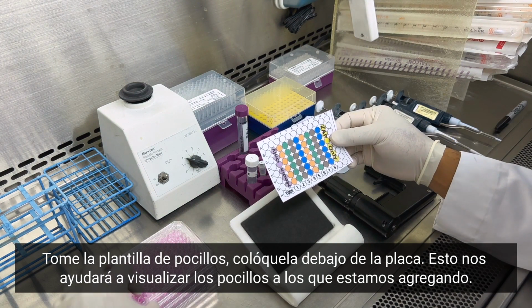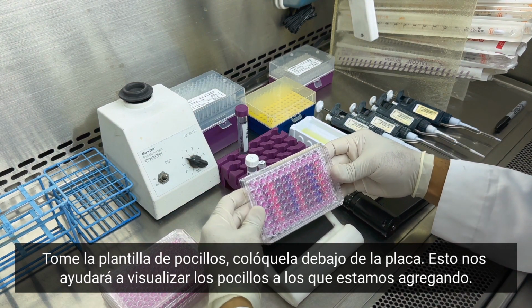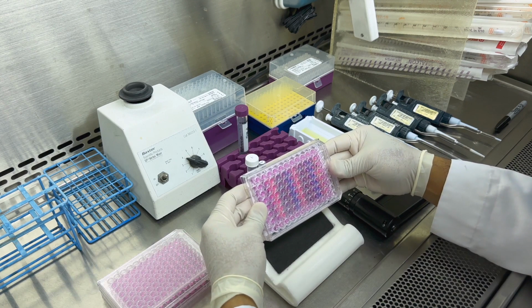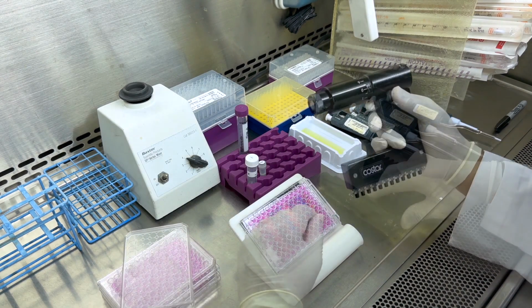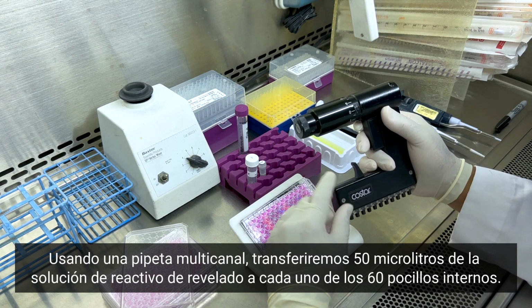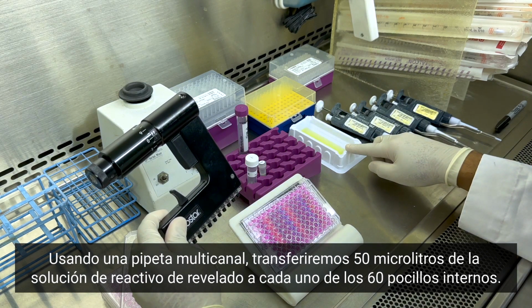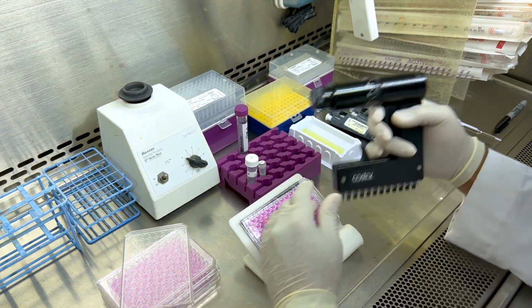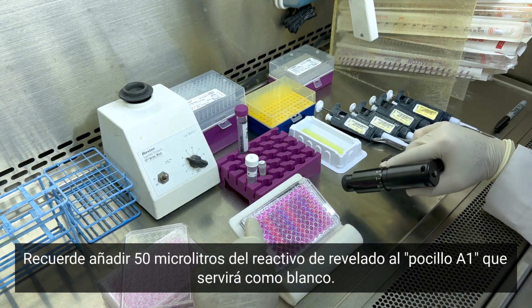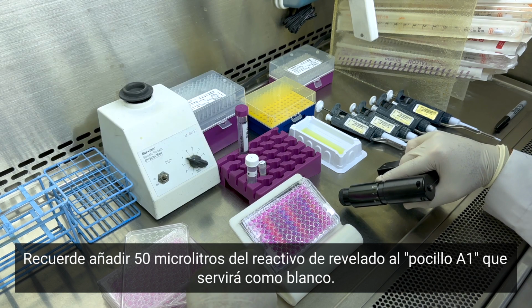Taking the well template, place it underneath the plate. This will help us visualize the wells that we are adding to. Remove the lid. Using a multi-channel pipette, we will transfer 50 microliters of the developing reagent solution to each of the inner 60 wells. Remember to add 50 microliters of the developing reagent to well A1, which will serve as the blank.